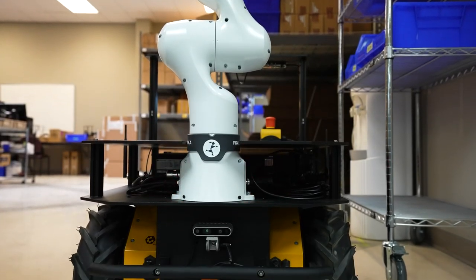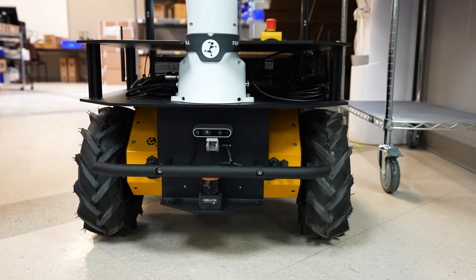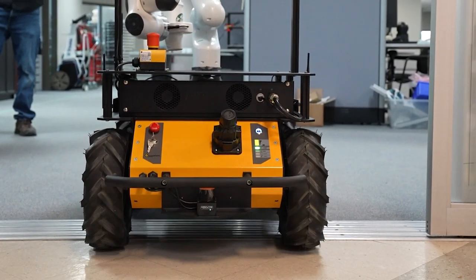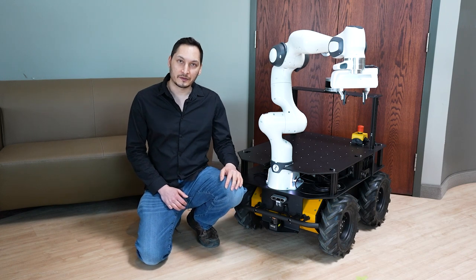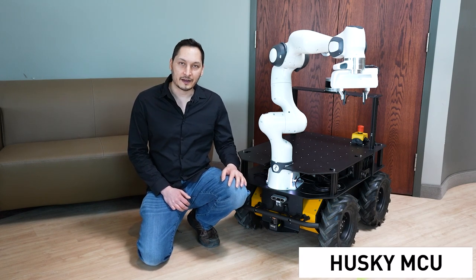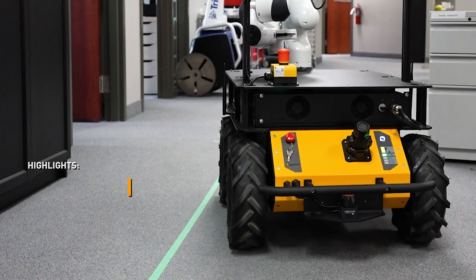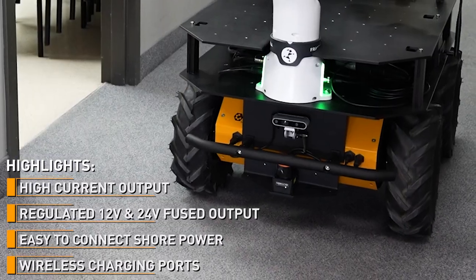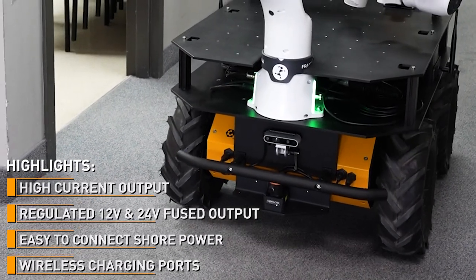This robot was built on the ClearPath Husky-based platform, which is known for being versatile, rugged, and easy to use. In addition, this robot includes the newest revision of the Husky MCU. This offers high current outputs, regulated 12 and 24 volt fused outputs, as well as easy to connect shore power and wireless charging ports.